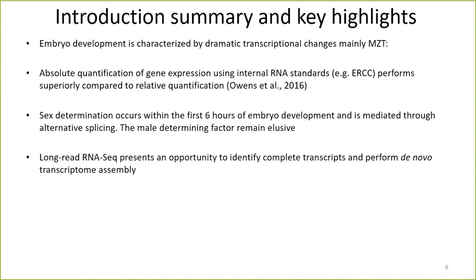Actually, just to be honest, at the beginning of this study, what we really wanted was to identify the male determining gene, which we knew at the time resided on the Y chromosome, the Y chromosome being highly heterochromatic and highly repetitive. We thought that using the long reads from Oxford Nanopore would give us the best opportunity to identify this gene. But we thought that while we're trying to identify that, we might as well explain or describe the transcription events during embryo development.